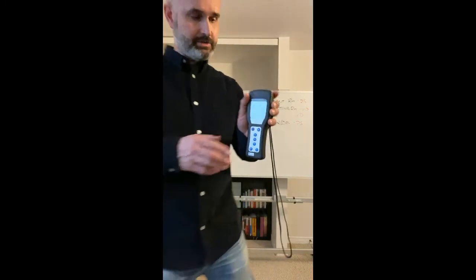I won't get into the mechanics of how one of these works, but essentially a swab is used to pick up contaminants on the surface, dropped in here, and essentially this thing is going to give us a number. Now, the number correlates to what could be perceived as a pass or a fail.